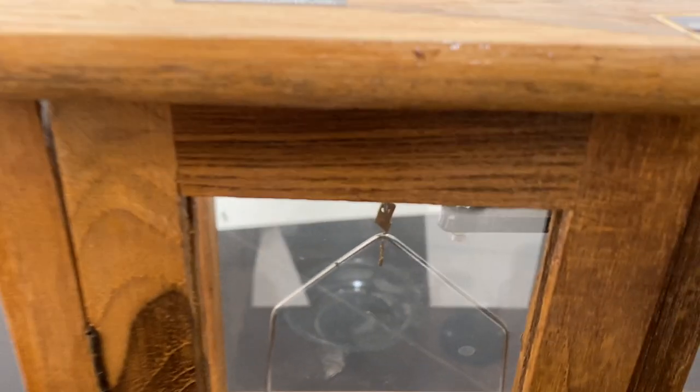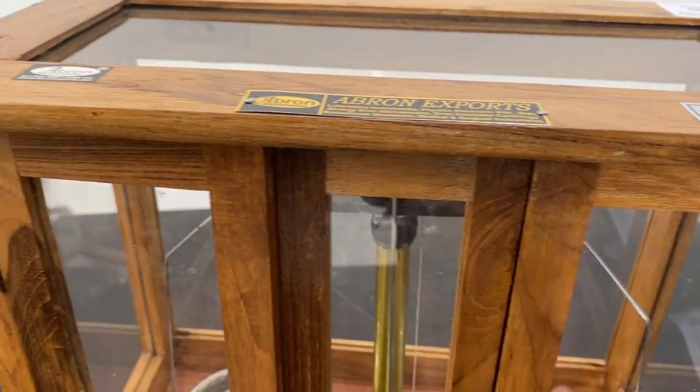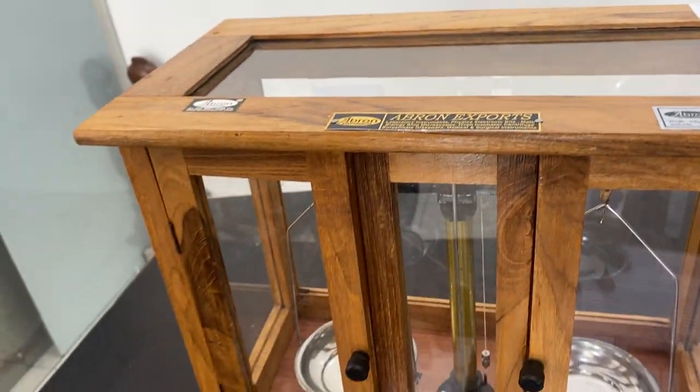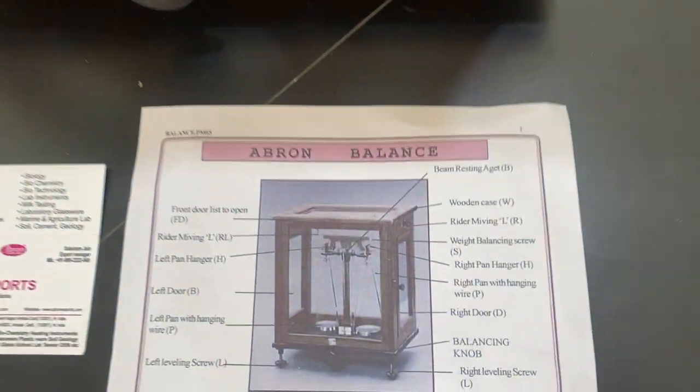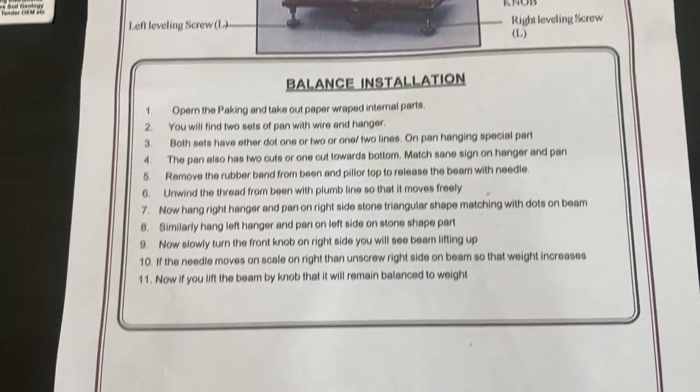Similarly on the second side, the installation is the same. There is a manual included that tells you about the parts and how to install them.